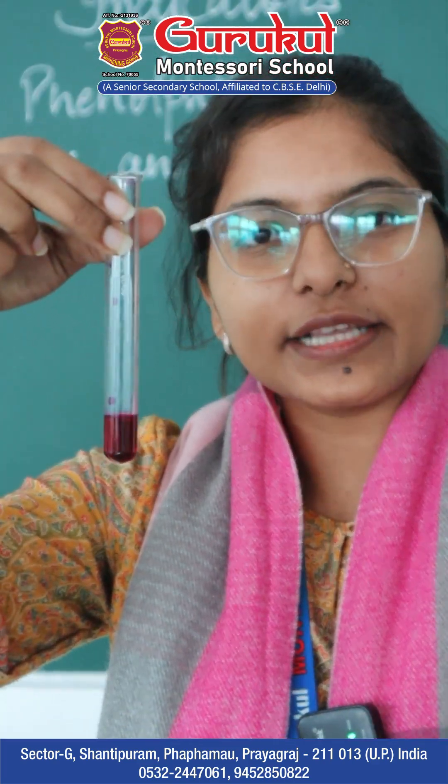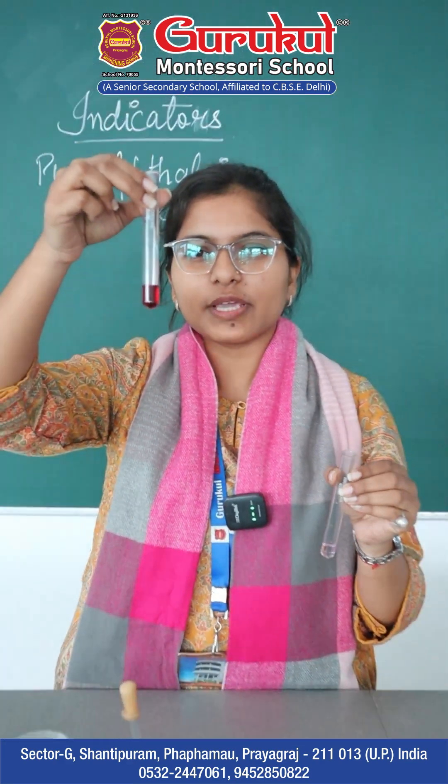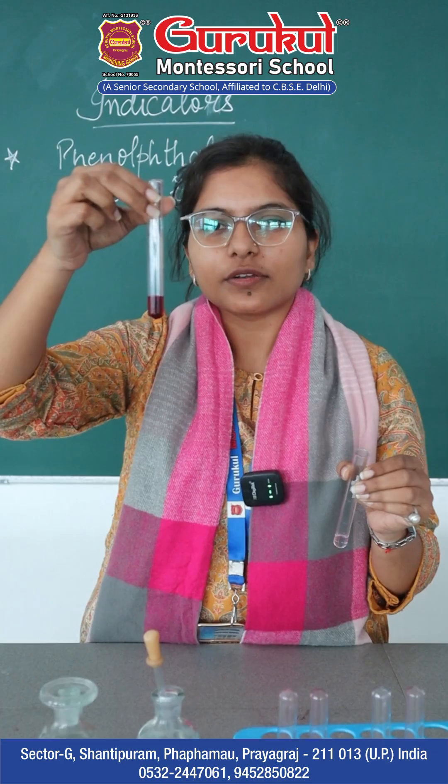Seeing these two tubes, we get the result that on adding the acid with the phenolphthalein, it gives a colorless solution. And on adding sodium hydroxide as a base into the phenolphthalein, it gives a pink solution.